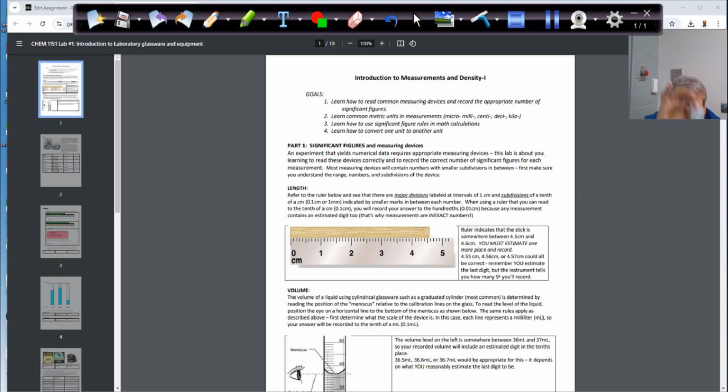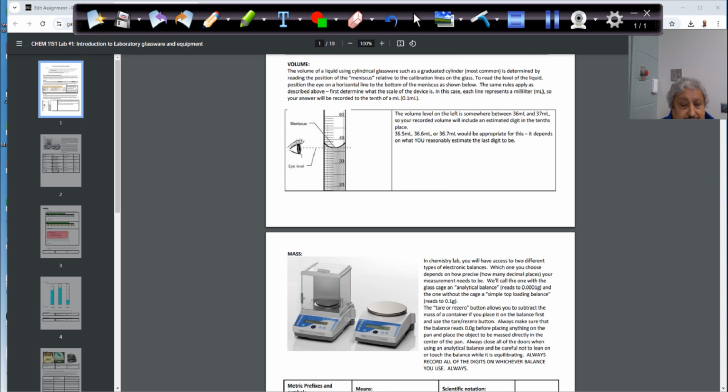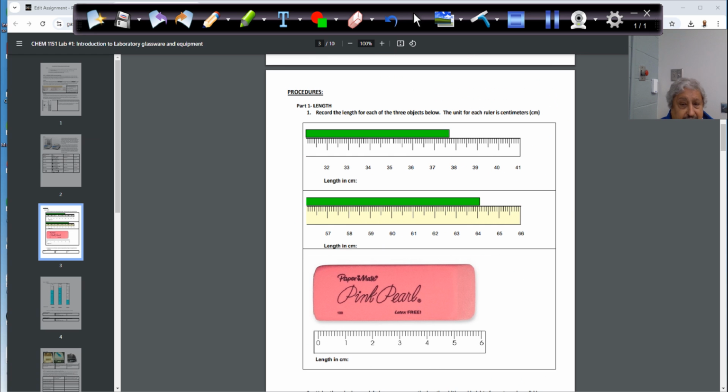You will have 4. In the past we had 5, but you have 4 of those, correct? And we will determine their densities, and then put this one here in an Excel sheet, and then from there we can get the slope of this linear relationship between mass and volume to get the density, correct? But before that, we have to train ourselves to start, of course, with the procedure itself.